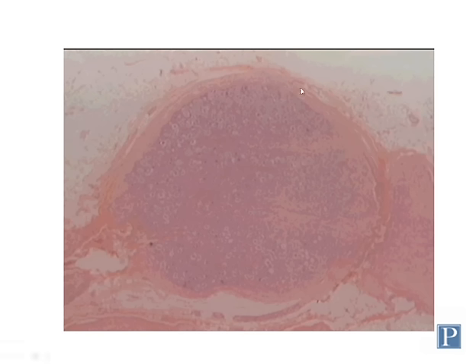This is a sensory ganglion called a dorsal root ganglion. These contain the cell bodies of pseudo-unipolar sensory neurons. Dorsal root ganglia are part of the dorsal root formation on the dorsal side of the spinal cord. These ganglia are said to be encapsulated, so they are covered with a thick connective tissue sheath or capsule right here that's composed of dense irregular connective tissue, and in some places this capsule actually penetrates deep into the ganglion here.